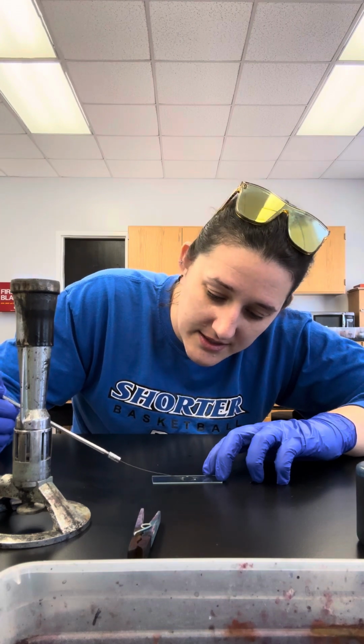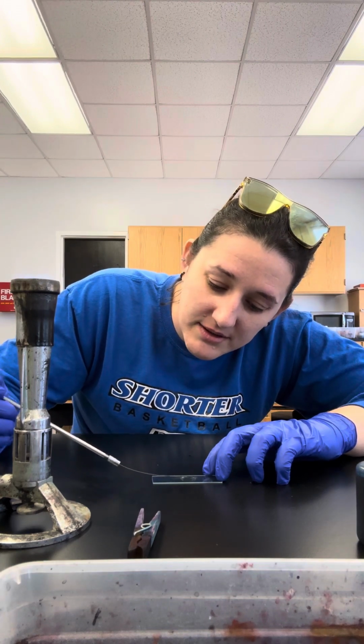Why do we want to spread that around a little bit on the slide instead of keeping it a pretty fat water droplet? I know you can't really answer me on this, but we want to spread it around so that as we set it over to air dry for 5 to 10 minutes, it doesn't take as long. Because that surface area allows it to dry a lot faster.